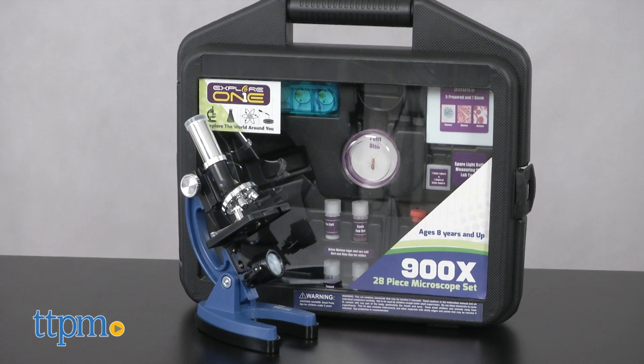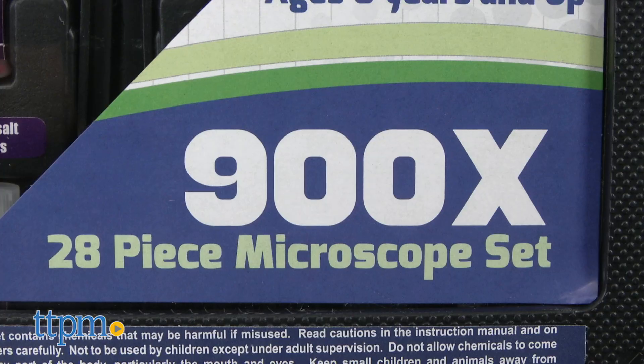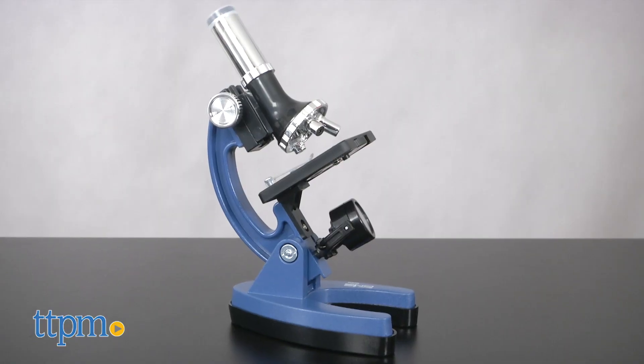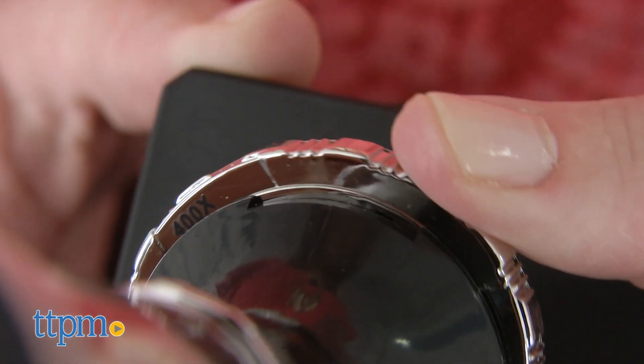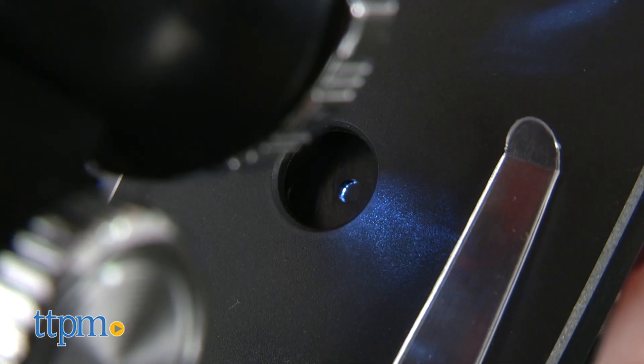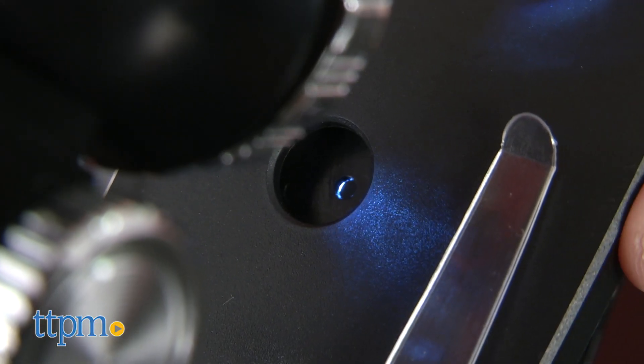This comes with 28 pieces inside a carrying case so that kids ages 8 and up can explore and experiment. The microscope has three magnification powers ranging from 100x to 900x, and you can turn on a light and use color filters in your observations.